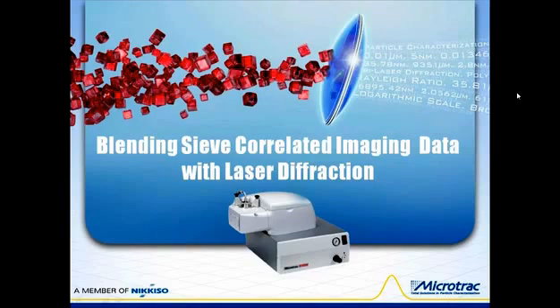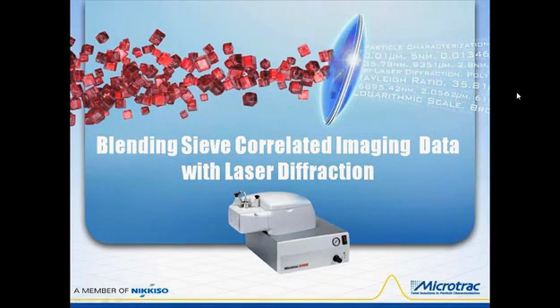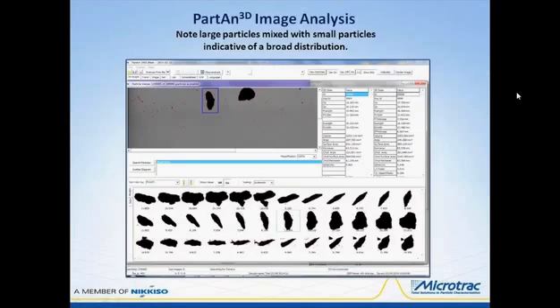Phil? Yes. Hi, everybody. What I'm about to describe to you is a method that will allow us to combine particle size data distribution over the range from about 60 nanometers up to 125 millimeters. So we're able to discuss the concept of nanoparticles as the smallest size all the way up to the largest size, which is actually being measured by the Partan 3D into sizes of inches.